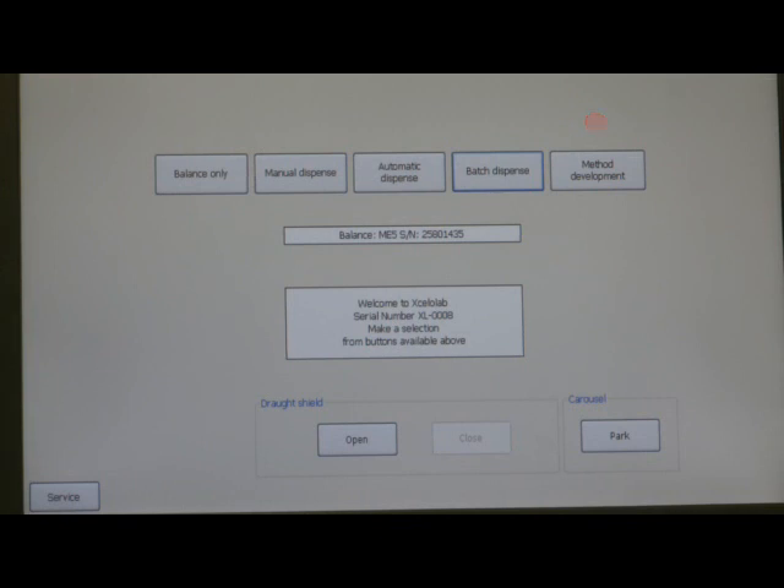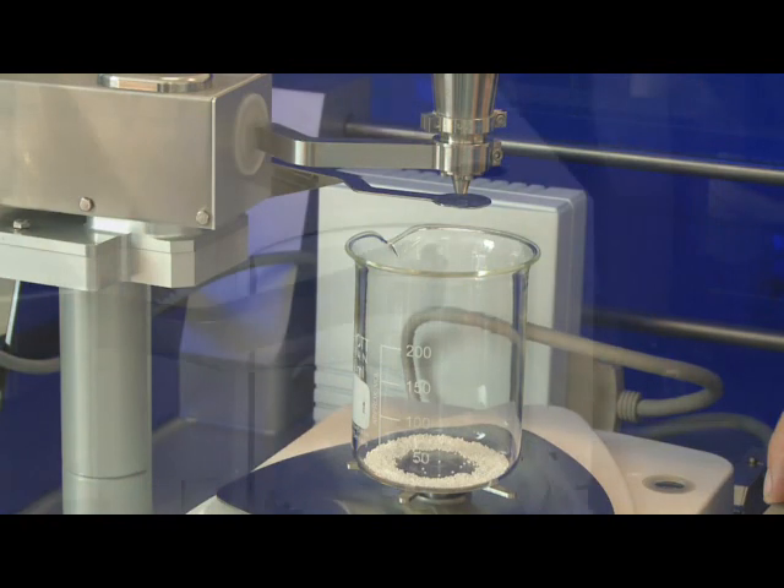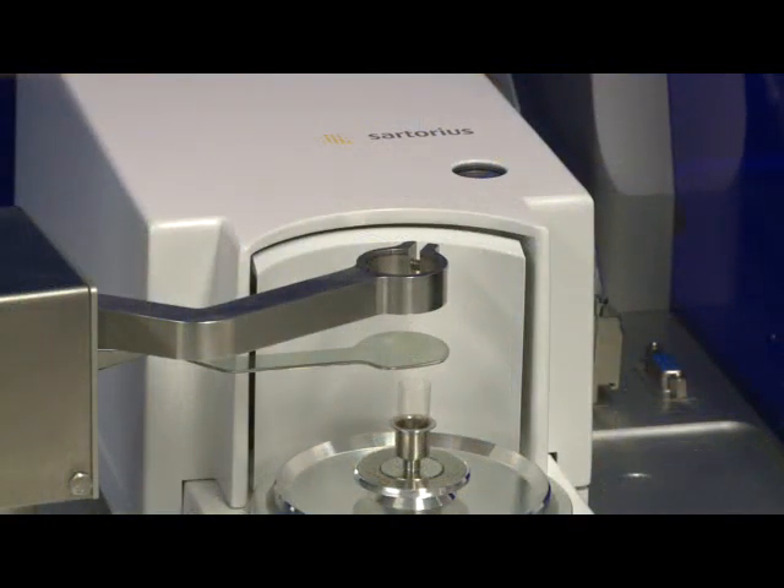In balance only mode, the balance is tared. The item to be weighed is placed on the balance pan and the reading is taken. Before starting any dispense, the receptacle is placed onto the balance pan and the dispense head, which contains powder, installed.